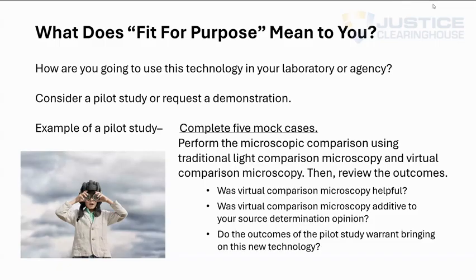Add it to your workflow. Did it give you anything additive to your source determination opinion? Did it warrant these outcomes? Did they warrant bringing on this new technology? And you can request a demonstration or have this technology brought in by the vendor and be able to utilize it. This will really help you develop your validation plan and make sure that you have the understanding of that technology to really write a comprehensive plan so that you know what your fit for purpose is.